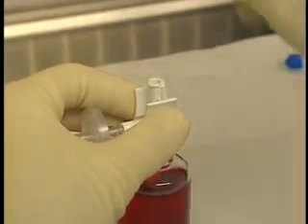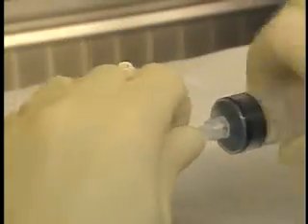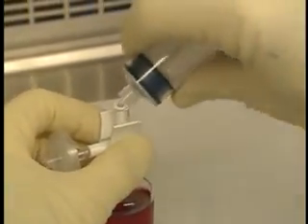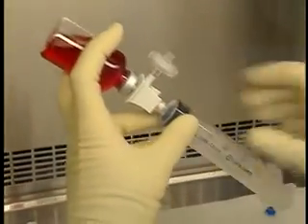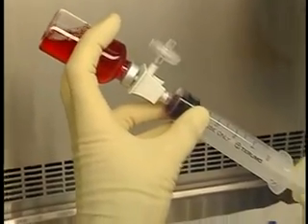Attach the syringe to the dispensing pin, aligning the graduations so you can read them as you withdraw the solution. Invert the vial syringe assembly, holding it from the bottom with all your fingers. Keep the assembly at a 70-degree angle with the filter facing upward throughout this step of the procedure.